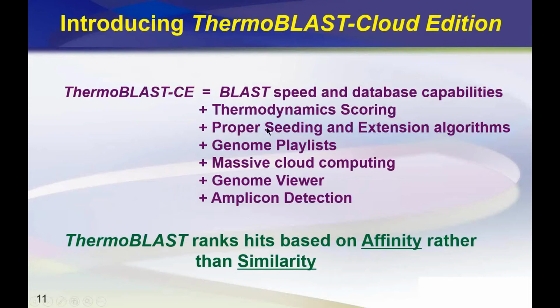We've completely rewritten the seeding and extension algorithms that are in BLAST. They're really completely different, how we do the algorithm for finding the hits. We've added something called genome playlists. I'll give you a whole slide about what that's about.